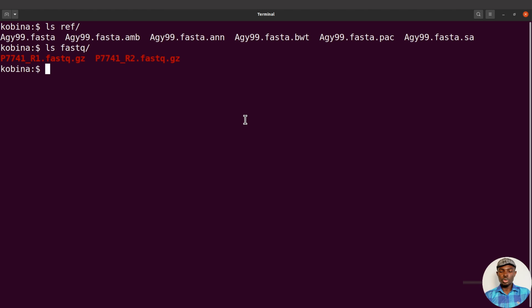In that video, I showed how to write a Nextflow script to perform quality control using FastQC. All right, so quality control involves assessing the quality, and it also involves trimming. So you can trim adapters. You can also filter reads. Maybe you may want to remove reads that have an average quality below a certain threshold. So you can use other tools to do that. But those things are subject for another day. I'll make another tutorial for that also. But for now, let's focus on getting the script for mapping our reads. That's what we want to do now.